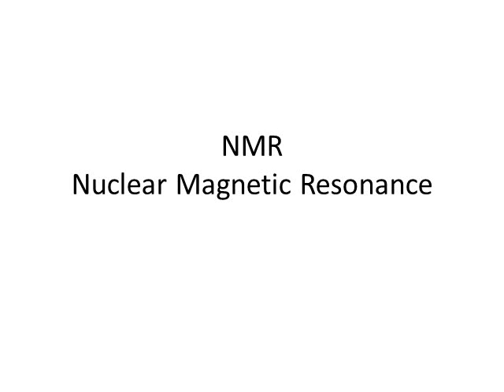Alright, welcome back to Organic Chemistry. This is the fourth in our four-part presentation on nuclear magnetic resonance spectroscopy. In the first section we learned about the basics of spectroscopy and of carbon-13 NMR. In the second section we saw how we could start with the carbon-13 spectrum and interpret it to figure out the structure of the molecule.